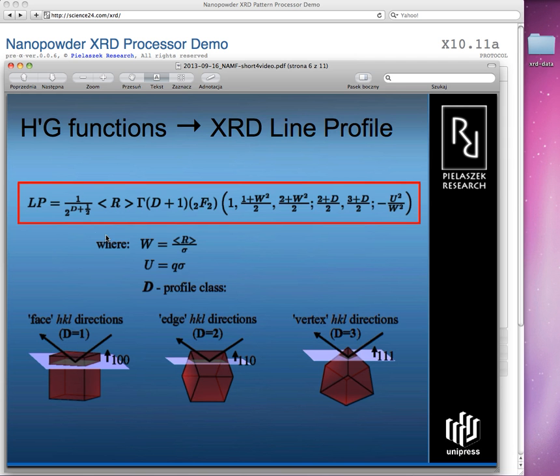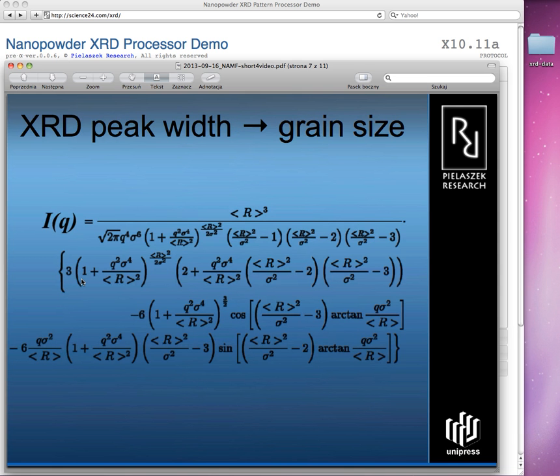The first describes spherical grain sizes. It is spherical grains, it is not shown here. And another three versions describe grains which are delimited by planes with three different directions. It is not really important to you how it works. However, for the time being, we use the simplest phase form of this expression.